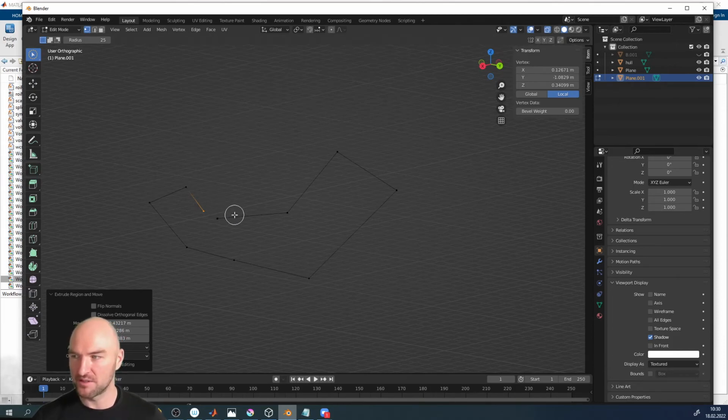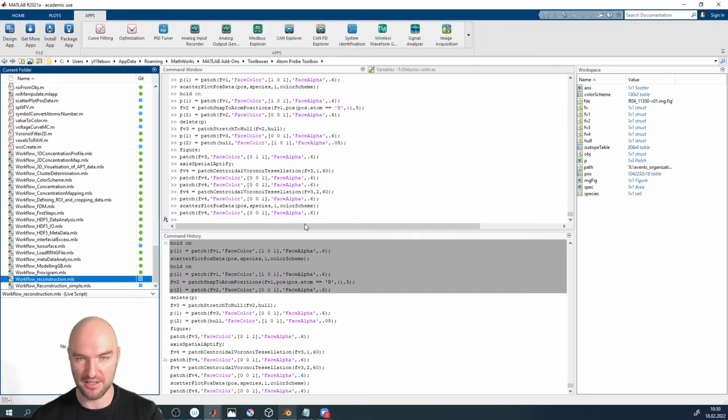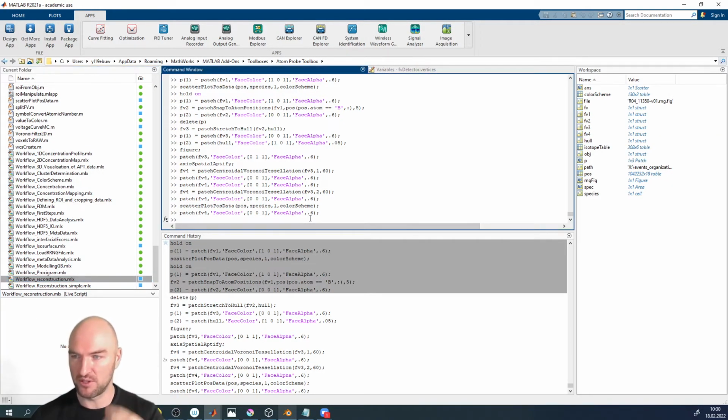Or sometimes with our cluster code, our cluster code also outputs the barycenter of your individual clusters, so you can do all of the analysis with respect to just clusters. So you can have a proxigram to clusters, and it's something we have in some papers.